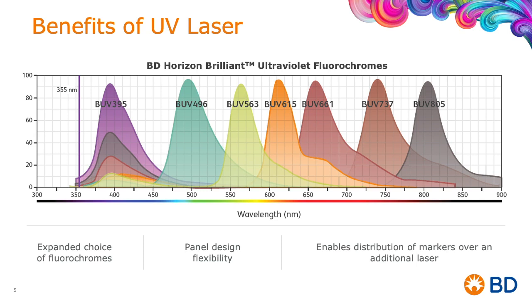We reduce spillover. And we will talk about the ability to distribute fluorochromes across multiple lasers and a wider spectrum to minimize spectral overlap and spillover. I will go into this concept in depth before showing a practical example of how that translates in better panels and ultimately better biology.